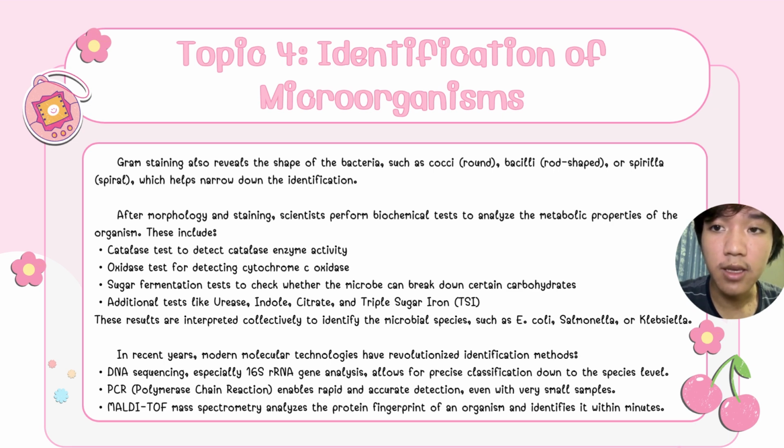Additional tests include urease, indole, citrate, and triple sugar iron. These results are interpreted collectively to identify the microbial species such as E. coli, Salmonella, or Klebsiella.